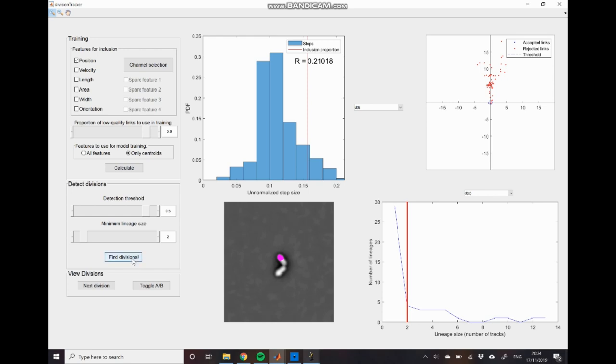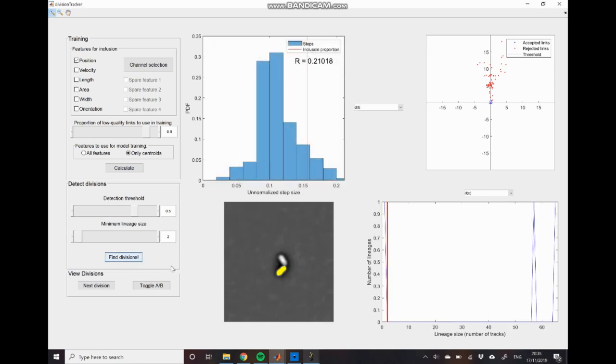So now I've set that as 0.5. I will click find divisions. And you can see that this already looks much better. So firstly we can check that this initial cell is still correct which it is.